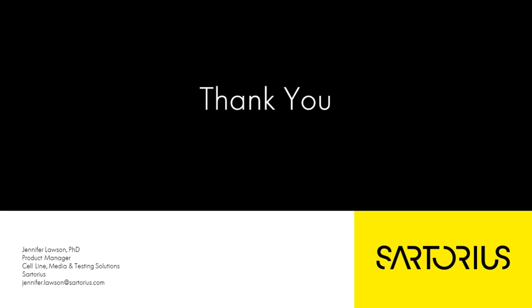Okay, well, I think we have time for just one more question. If we didn't get to your question, we will be passing all the questions on, and Jennifer can follow up with you directly. The last question for the webcast is, what validation criteria on repeatability and precision do you propose? So, what validation criteria on repeatability and precision do we propose?